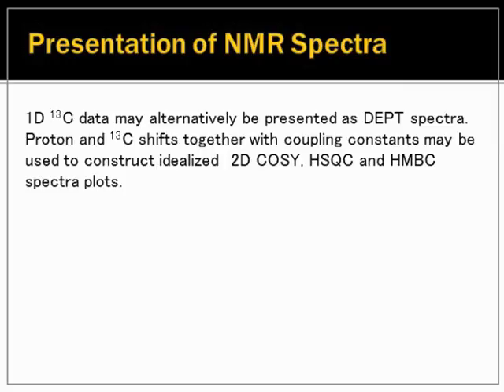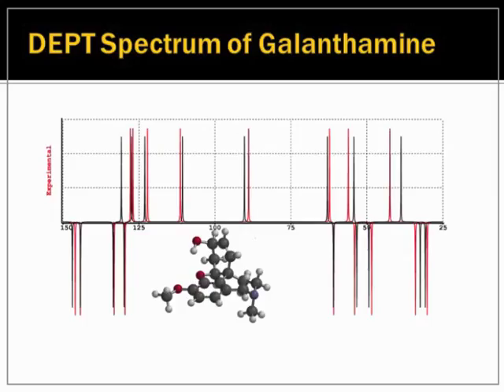them, you now have the fundamental information to produce many different variations of NMR spectra. In other words, the 2D spectra. So given the calculated data, again, whether or not coupling constants are calculated or empirical, you can now do things like COSY spectra, a lot of the common 2D spectra. You can also do DEPT spectra, which has nothing to do with coupling constants. Let me just show you examples.